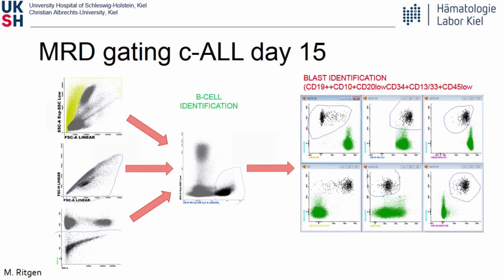With such clear data, we then gate on B cells detected by CD19 expression, and then we show the different fluorochromes we are staining, which I've shown before, for example the EuroFlow approach or the other approaches, and you then depict the normal B cells against the aberrancies. In this case, it's quite easy because it's a day 15 sample, bone marrow puncture of a childhood BCP ALL. And this is easy because at that time point, you barely see any B cell progenitors. So you see here mature B cells with high CD20 expression, low CD10 expression, a quite high CD45 expression.